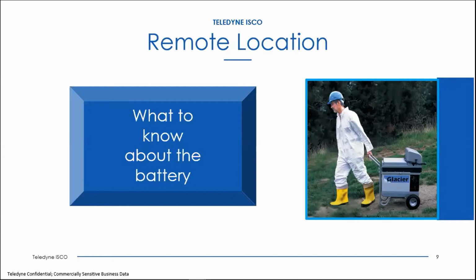The advantage to the NiCad is you get more charge and recharge cycles out of NiCad batteries. So if you're constantly deploying a battery every day and doing lots of charge and recharge cycles, then a NiCad battery is probably what you want to go with. NiCad batteries are what we see in a lot of tools, like drills and other tools around your house. That's where we mostly see NiCad batteries.